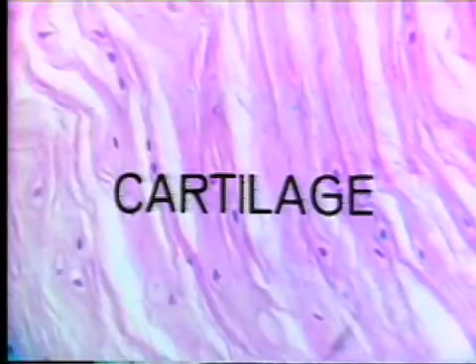We now have a post-test on cartilage. We'll give you 30 seconds for each slide. Now, we want the name of this tissue in the upper half of this section. What type of cartilage is this?